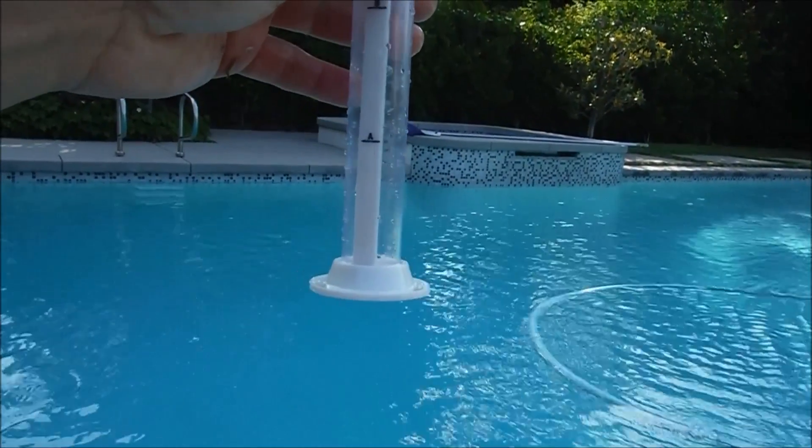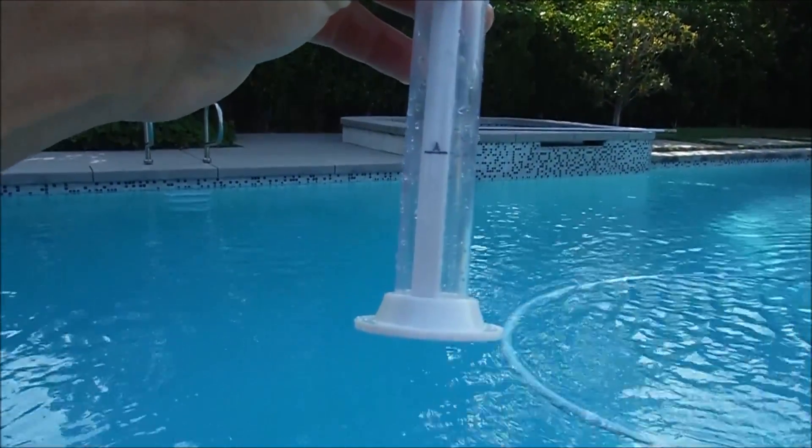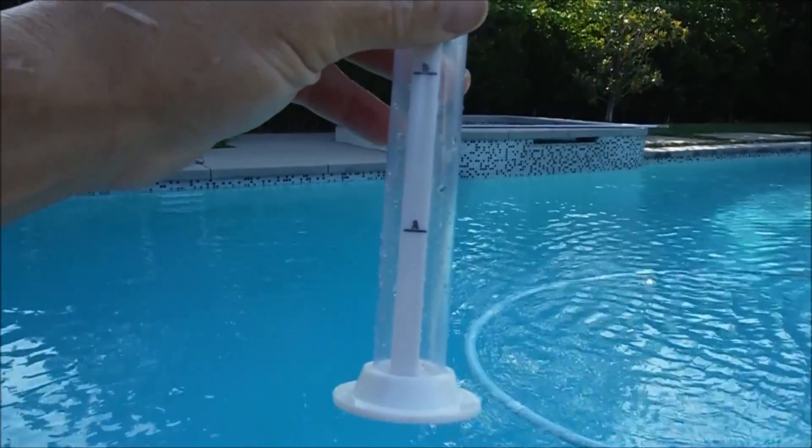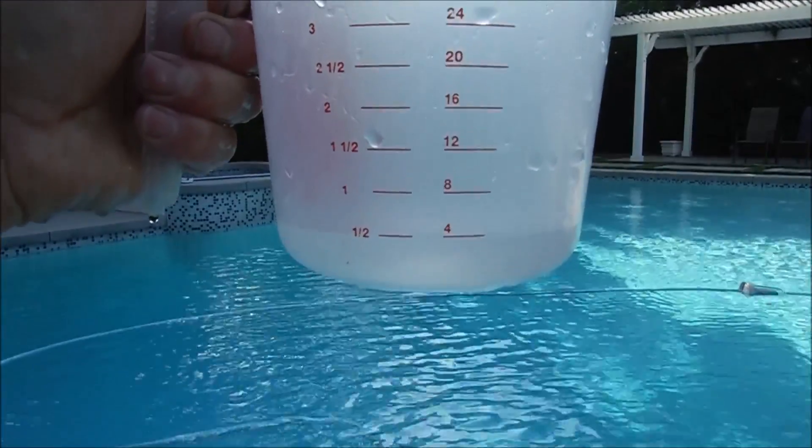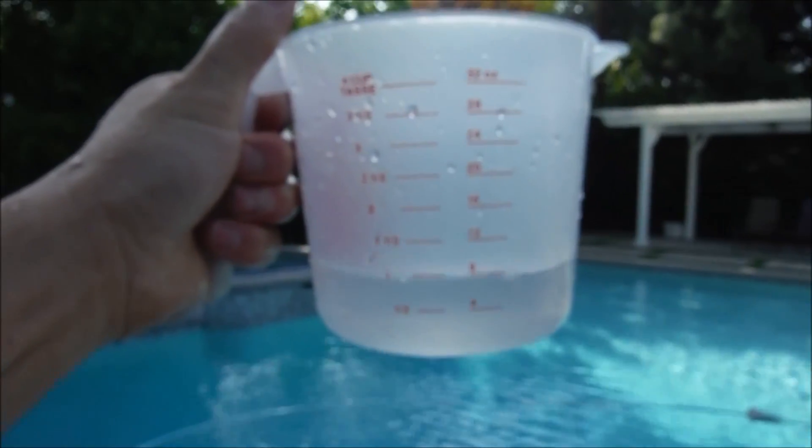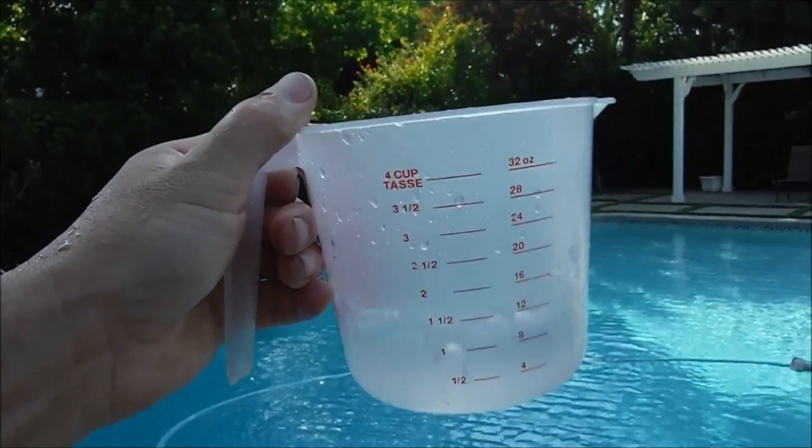And once you clean your vial after testing you want to do a dilution test. You want to fill line A up with half pool water, half tap water, and then line B up with the solution again. I'm going to get 4 ounces of pool water here. So I got 4 ounces of pool water so I'm going to fill up the tap water to the 8 ounce mark. I'm going to mix it together and pour it into the tester.